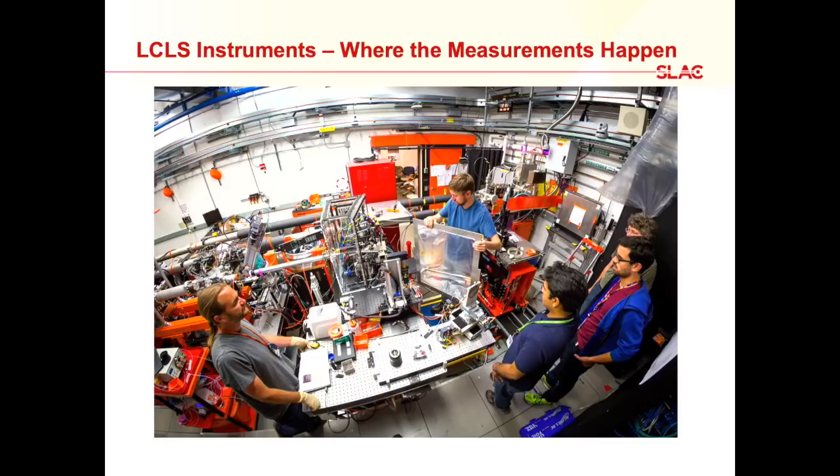So in practice, it looks like this. We have X-ray instruments where we deliver the beam to multiple systems to make these measurements. So those are some of the scientists setting up an experiment.